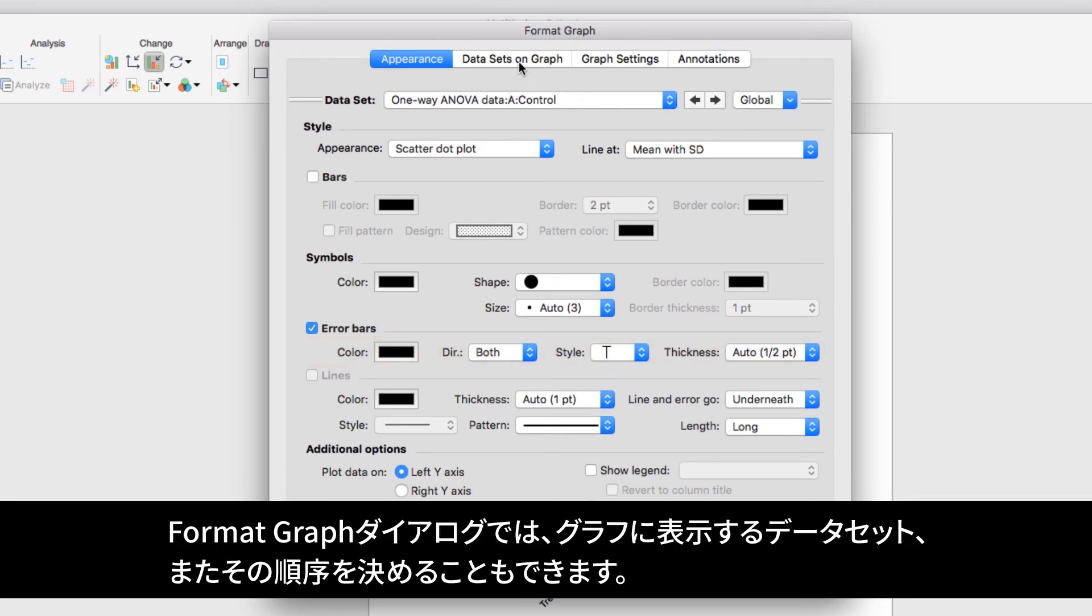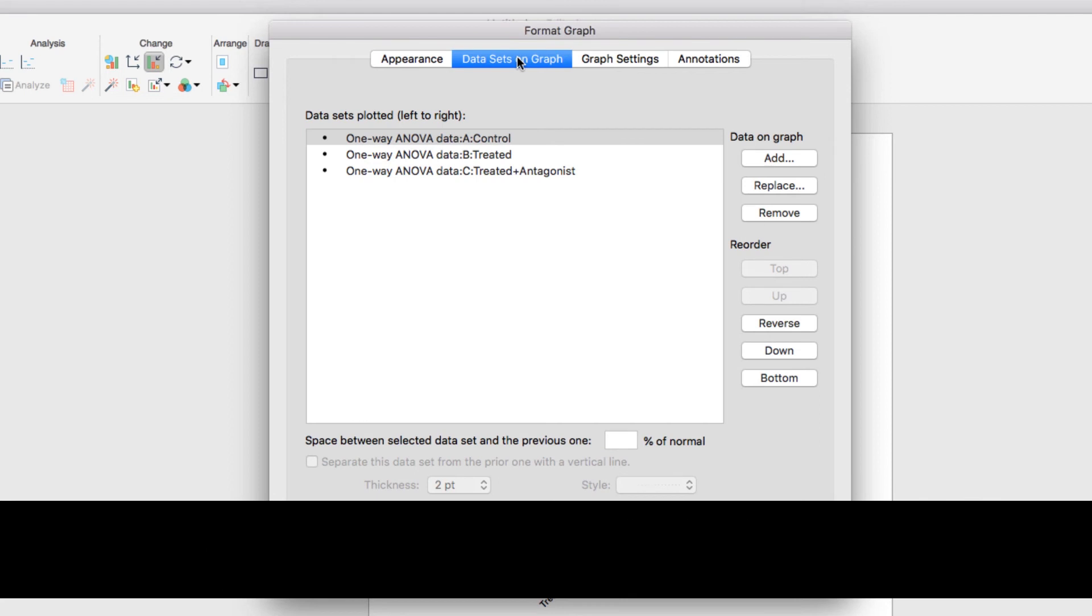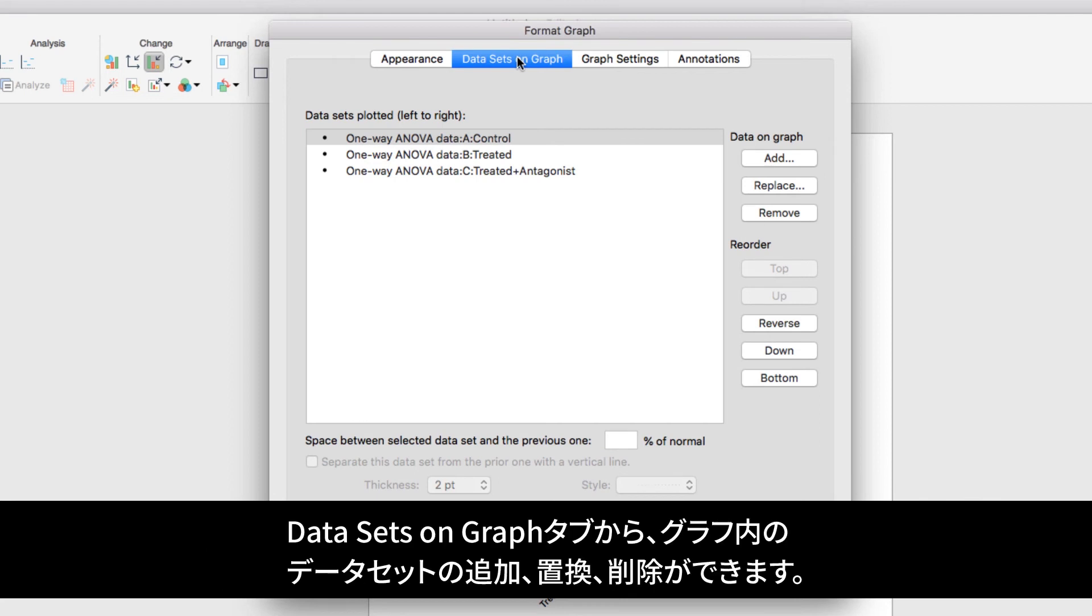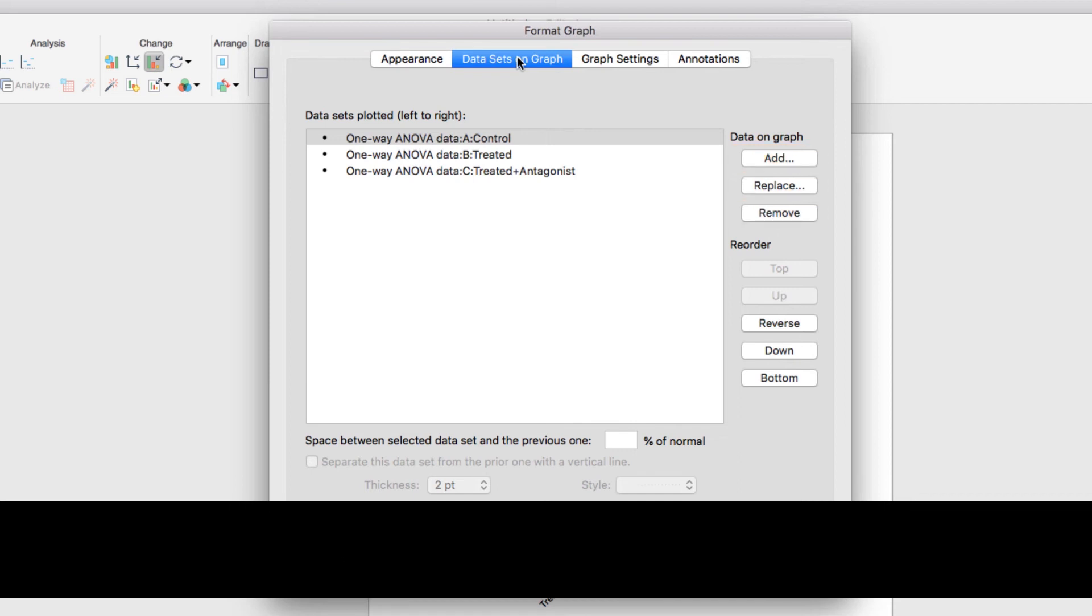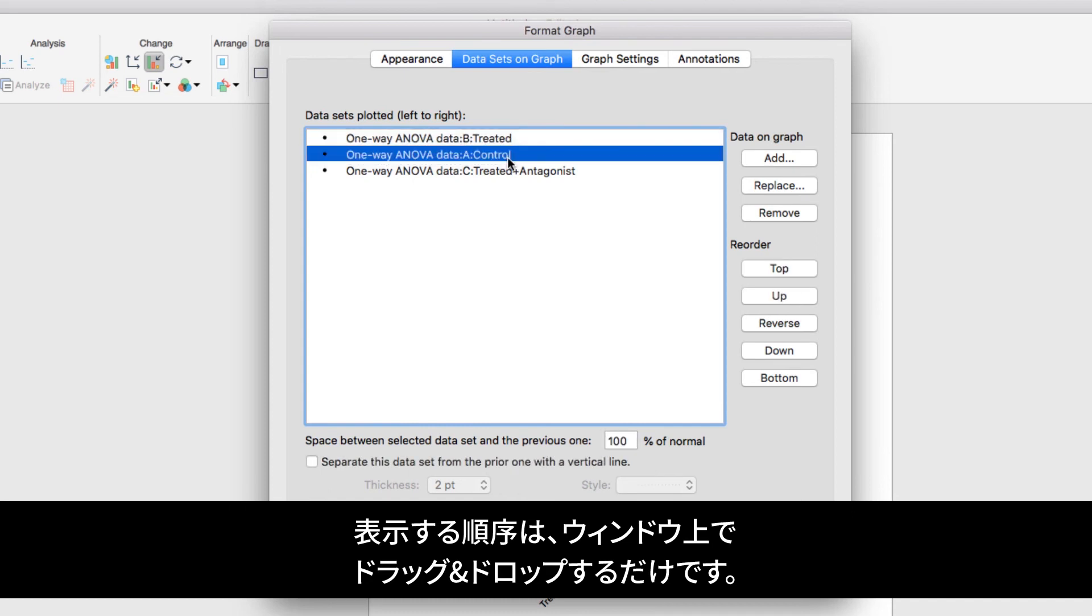The Format Graph dialog also lets you determine which datasets will be shown on your graph and in which order. For example, on this tab you have the option of adding, replacing, or removing datasets on your graph and determining the order that they're shown simply by clicking and dragging them within this window.